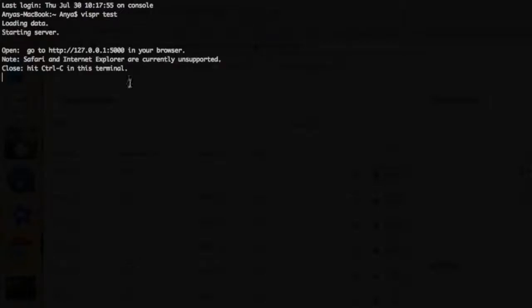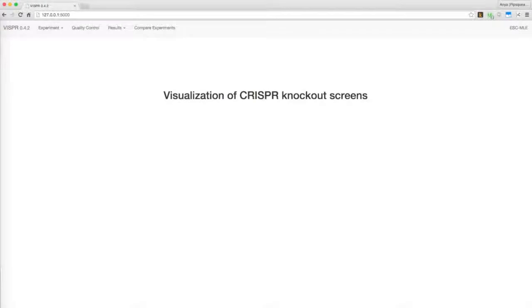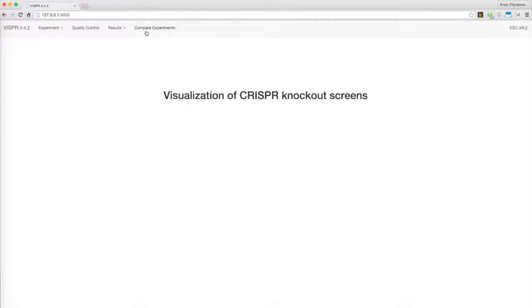A link will be returned. Pasting this into a web browser, you'll be redirected to the Vispr home screen. Across the top of the screen, you'll see four tabs: Experiment, Quality Control, Results, and Compare Experiments.